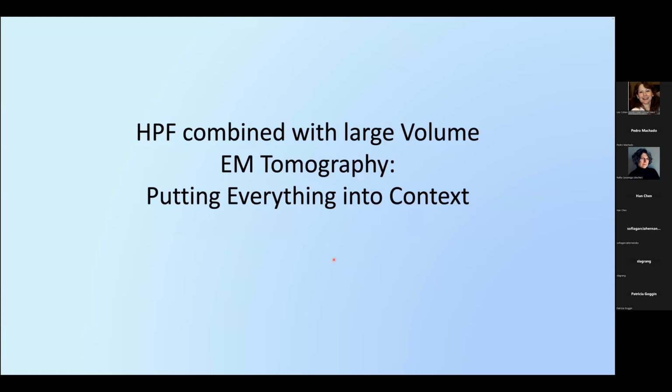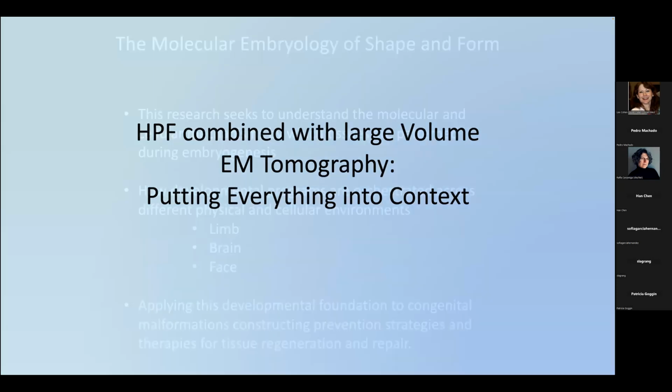Large volume EM is one of the techniques of the year this year. I think Naomi had mentioned that her group does a lot of large volume work. So I wanted to touch on this and how a project came where we couldn't use traditional ChemFix. We had to use HPF. And so that is how we put everything into context.